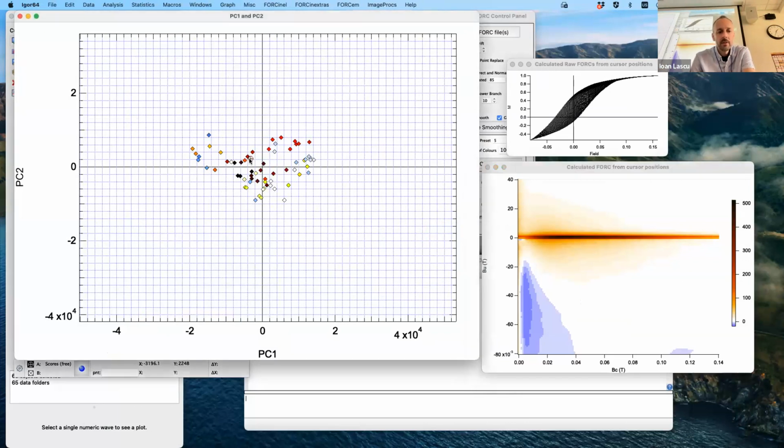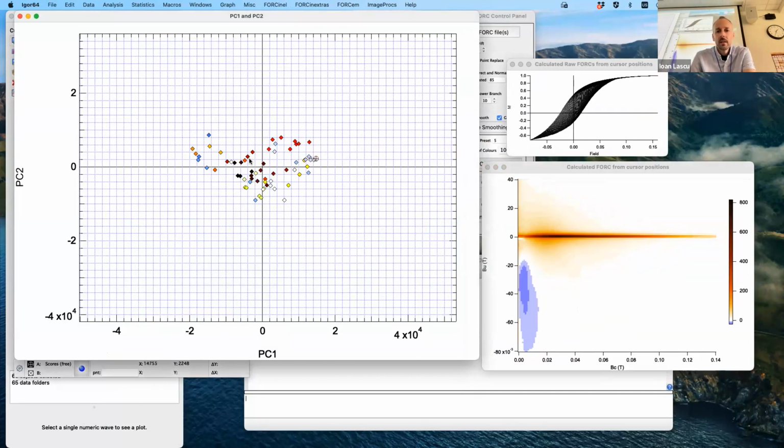Okay, so as we move in this space, as we move to this end of PC1, you'll see that you have sort of a typical magnetofossil signature in marine sediments or lake sediments, with a central ridge and some of this background, the negative area.